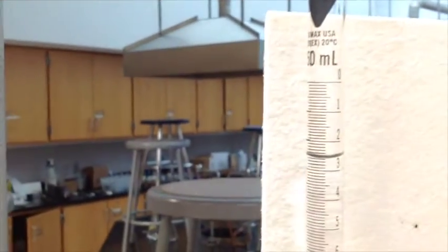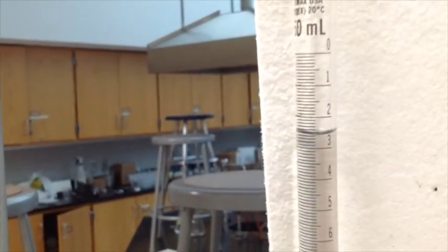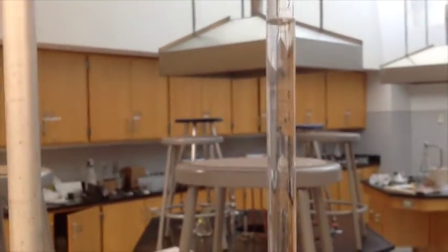I'll need both hands. I need to stop filming this for a second. Okay, so now we can see that I filled this up, and we need to read. So we read from the top down. So 2.6, it looks like, 2.6 milliliters. So I'm starting off with V naught of 2.6 milliliters.